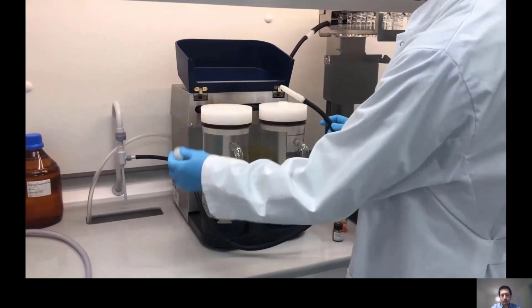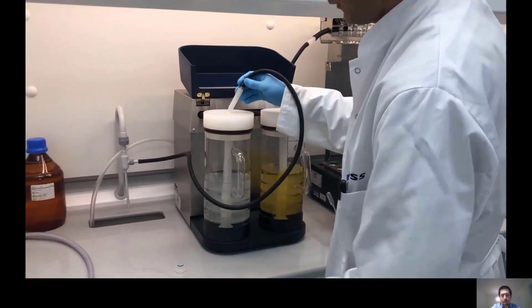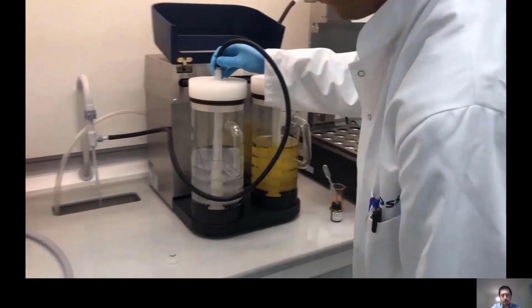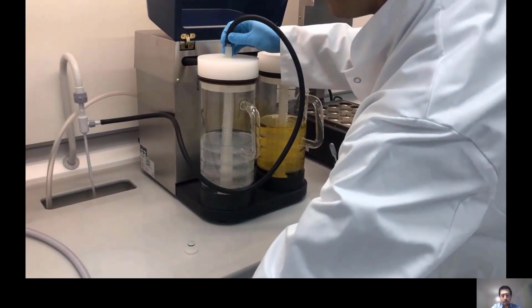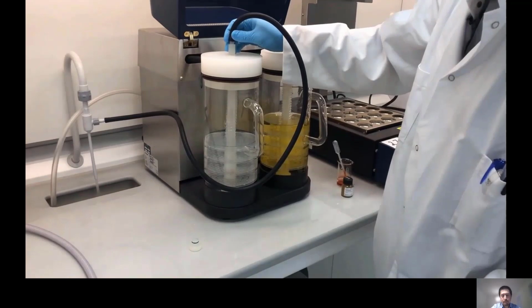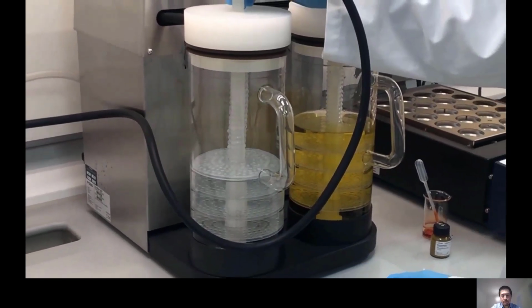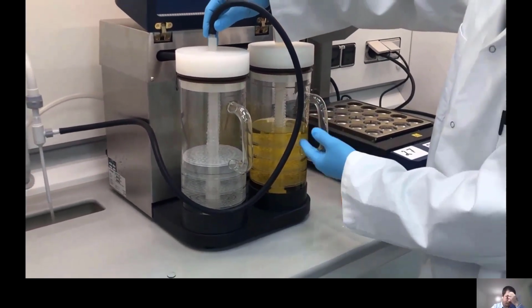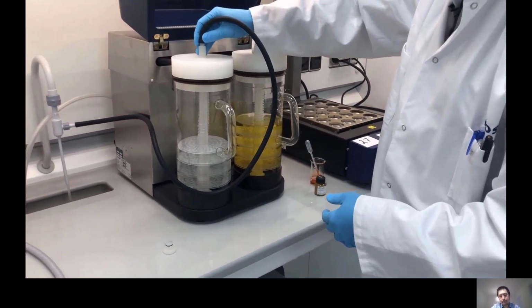You take out this sealing here, and you turn on the water aspiration pump. So now the liquid will be drained by using this water aspiration pump, and it goes through the same for the acid solution over here. So that's how it works.